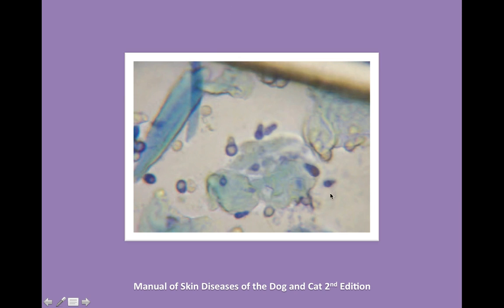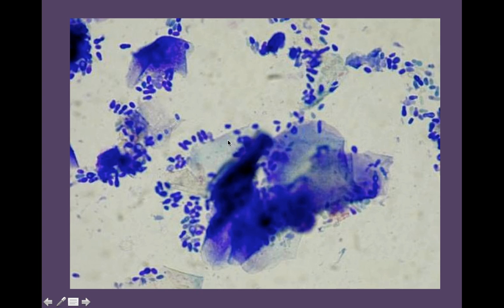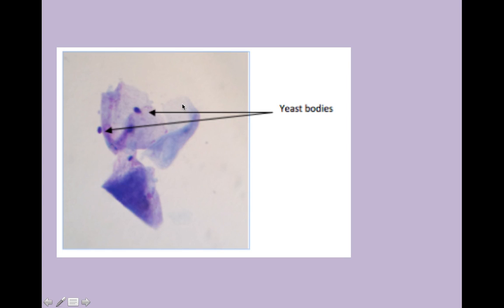Looking at a typical ear swab stained with three-step stain, you've got keratinocytes with some wax, cellular debris, and rolled-up keratinocytes. This is yeast — for me it always looks like a detective shoe, though some people think of it as little snowmen. Lots of keratinocytes in the background — superficial cells, intermediate cells, all keratinocyte family. This sample has lots of yeast, all those purple little buds. Budding yeast looks like the detective shoe shape, while non-budding yeast is just a singular little ball. Little yeast bodies can be seen kicking around on a keratinocyte.